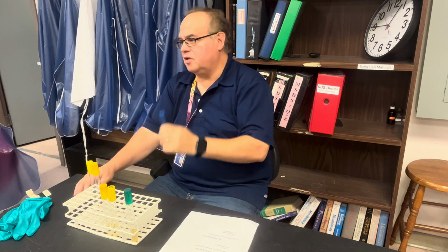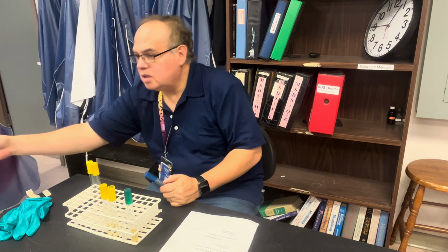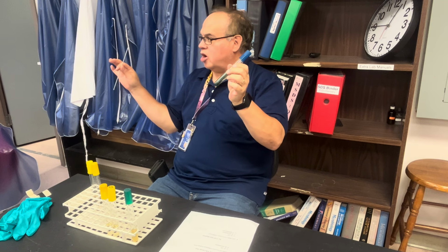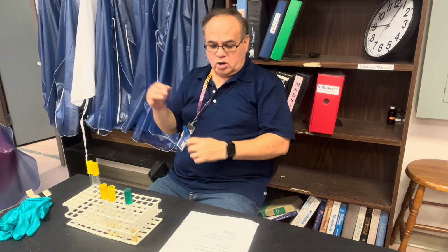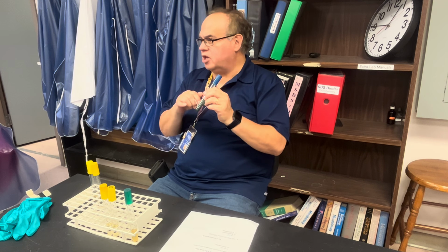And we're looking for the ability of a microorganism to use citrate as its only source of carbon. Okay? You're only going to use 2, so you need 2 of these. One of them you're going to put E. coli, and the other one you're going to put Klebsiella pneumoniae.